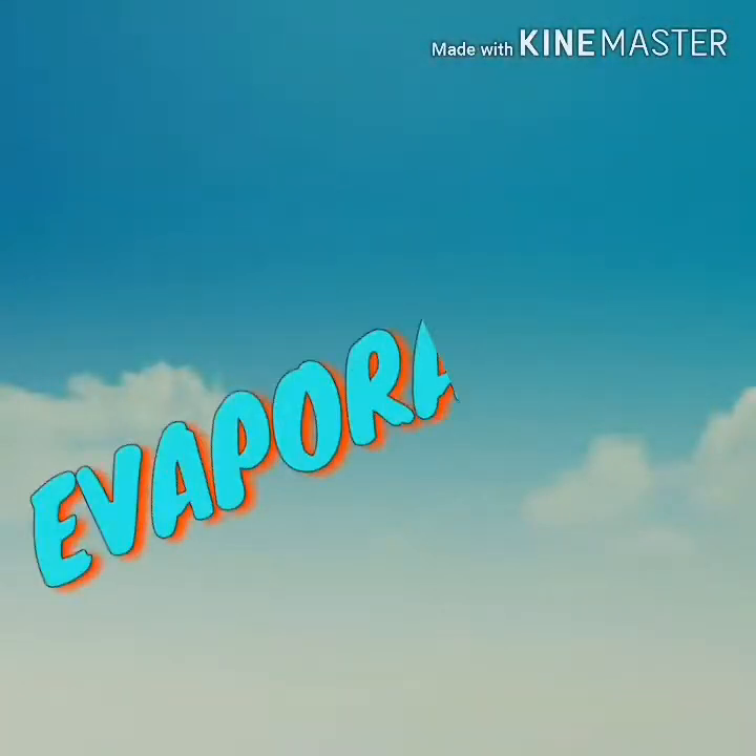And now we're going to proceed with evaporation. I'm Eliza. I'm Jillian. We're going to show all of you how to separate a liquid and liquid mixture.